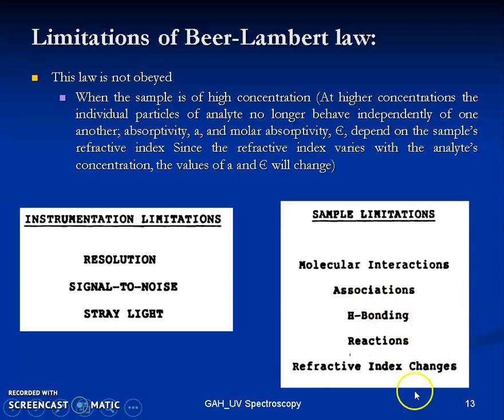If a compound is undergoing a reaction and it forms a product during the course of observation, then the compound is no more a compound, but rather a product or the degradant of that particular compound which is being measured. If that is undergoing any reaction, then that compound will not behave as an individual entity, but it is a mixture of things which appear as a peak in the UV spectroscopy.